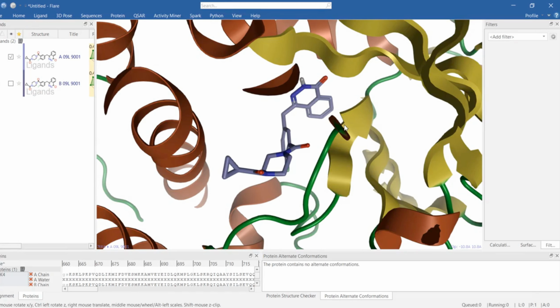Welcome to this new segment, an introduction to the drug discovery platform called Cresset Flare software. In this video, we will be covering the introduction of its graphical user interface. As you can see, this is the graphical user interface of Flare software.